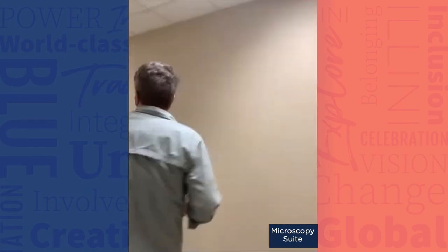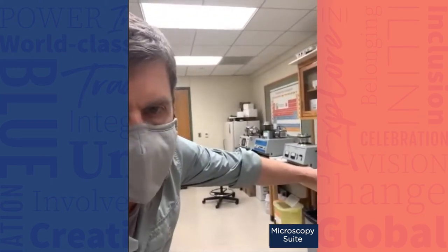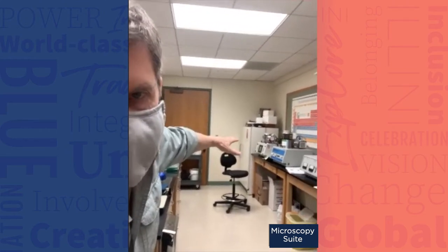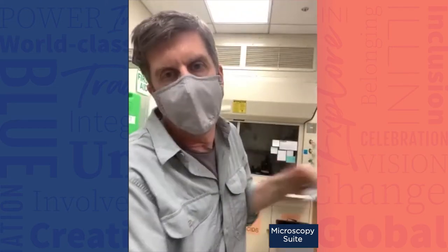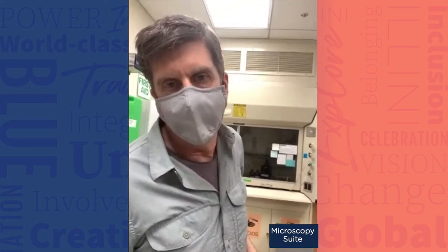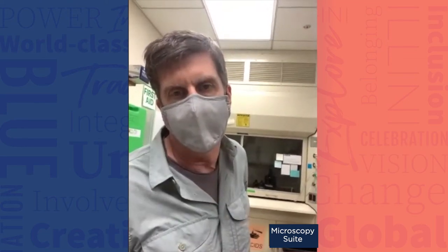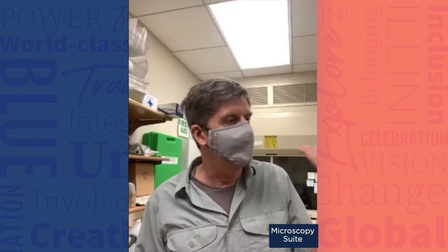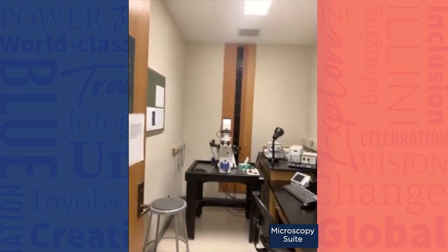We're going to go to the main part of the suite — this is the wet lab. We have an oxygen plasma cleaner, glow discharge for TEM, two sputter coaters for SEM — it's always good to have two in case you break one. We have a dual metal evaporator back here so that we can coat samples: you can put chromium on something and without breaking the vacuum then coat with something else. You put about 10 or 12 angstroms of chromium on something and then your other coating, and it actually seals better. The wet lab is available to lots of people, and this is a regular fluorescence microscope — a Zeiss.